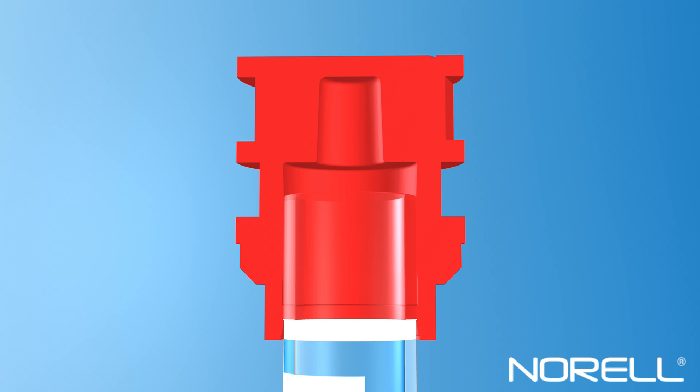In Stage 2 cap placement for Bruker sample jet use, simply apply additional pressure on the Norlock 2 Security Cap to engage the cap's locking mechanism onto the tube's security band. The cap is properly engaged when the bottom of the cap touches the top edge of the exterior tube marking area, forming a superior dual-stage hermetic seal.